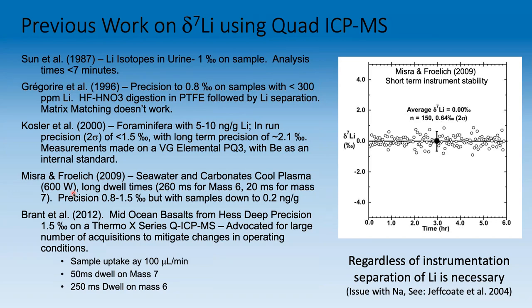I've not tried this without separating. I could, but if you do, let me know. I think it's going to affect your precision though. The ionization profile in the plasma will be changed based on the sample, right? So all your different reference materials that you were calibrating against have different levels of sodium, right? Absolutely. And it's not just the sodium, but sodium's the big one. Other stuff too. So separation basically is getting you away from a bunch of stuff, but primarily the sodium. Yes, exactly.